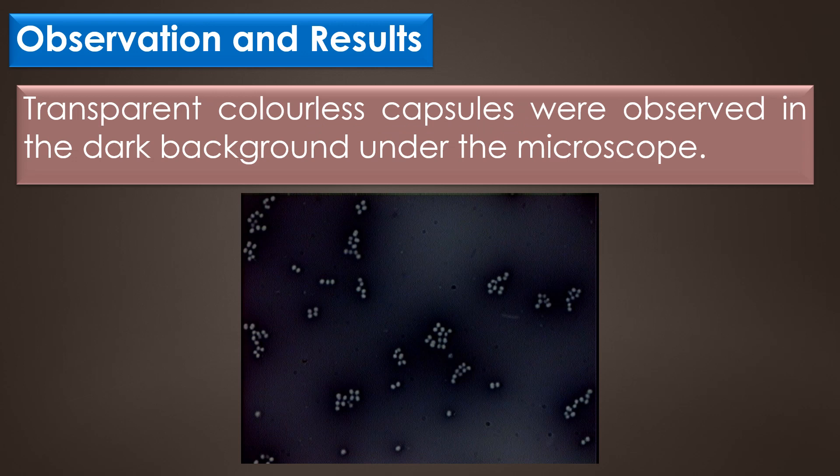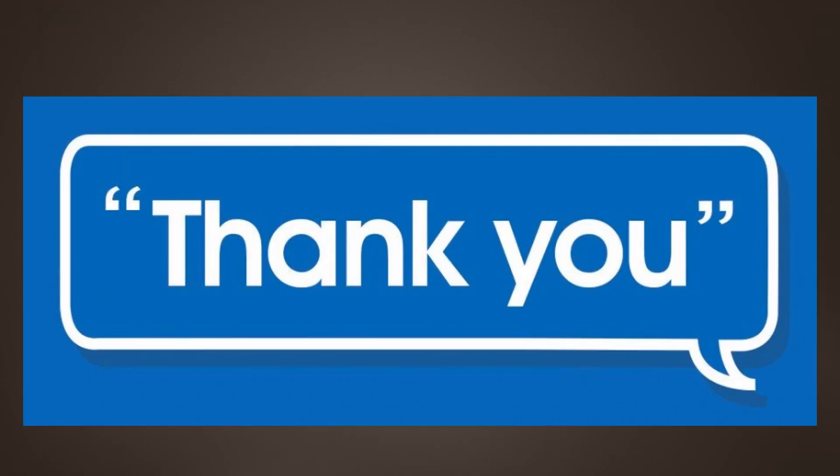Observation results. Transparent colorless capsules were observed in the dark background under the microscope. Dear viewers, thank you for your support. Thank you.